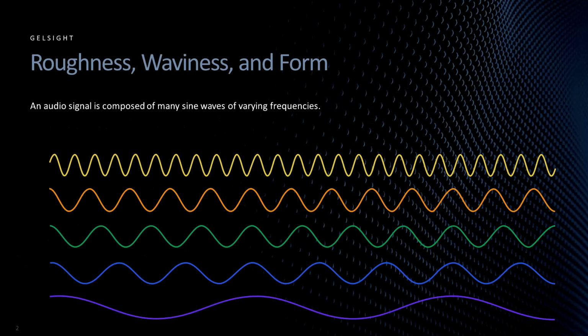When I began to learn about surface texture nearly 30 years ago, I was still a working musician, so at that time it helped me to relate the concept of surface texture filtering to music. I think that this comparison may be helpful to you as well.